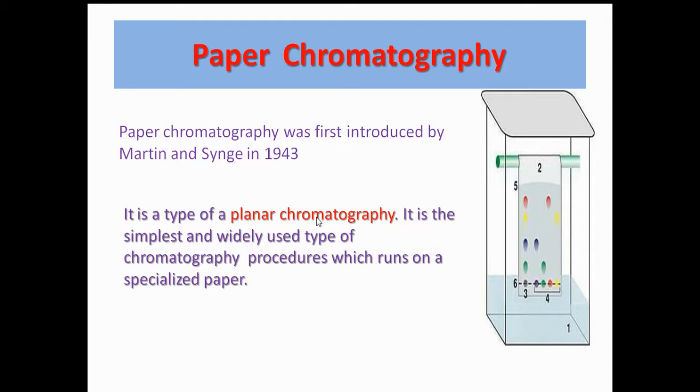The reason it is known as planar chromatography is that, in this case, the separation of the components takes place on the plane of the paper. So that is the reason why it is called planar chromatography.